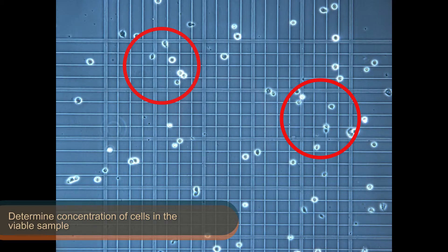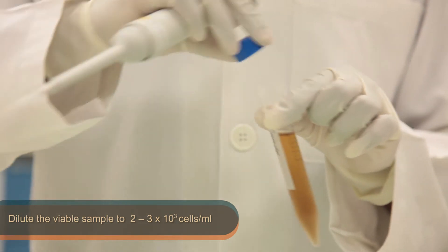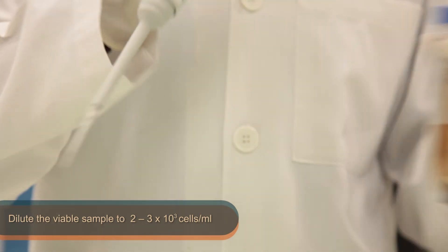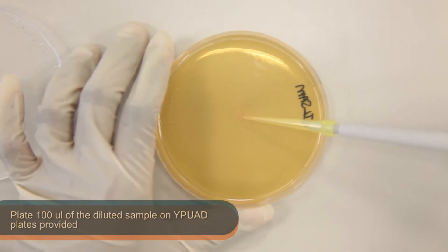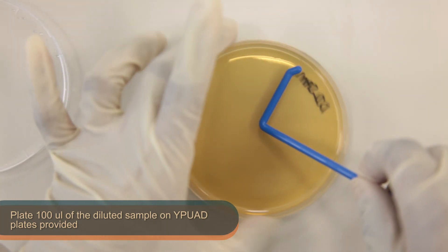Following this, determine the concentration of cells in the viable sample provided. Dilute the viable cells so that you have a sample of 2 to 3 × 10³ cells per milliliter. Plate 100 µL of the diluted sample on YPUAD agar plates provided.